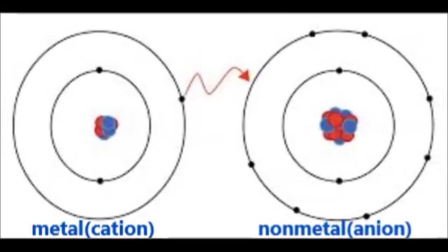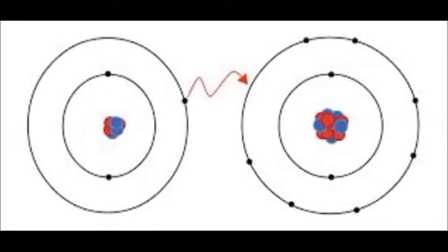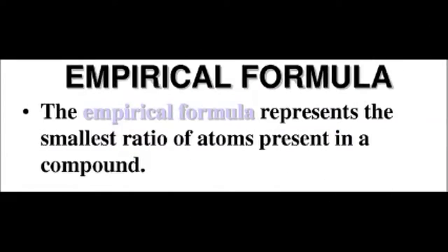The purpose of the lab was to determine the empirical formula of the ionic compounds. An ionic compound is formed by anions and cations. Cations give their electrons to the more attractive anions. Like stated before, we will find the empirical formula of two ionic compounds.